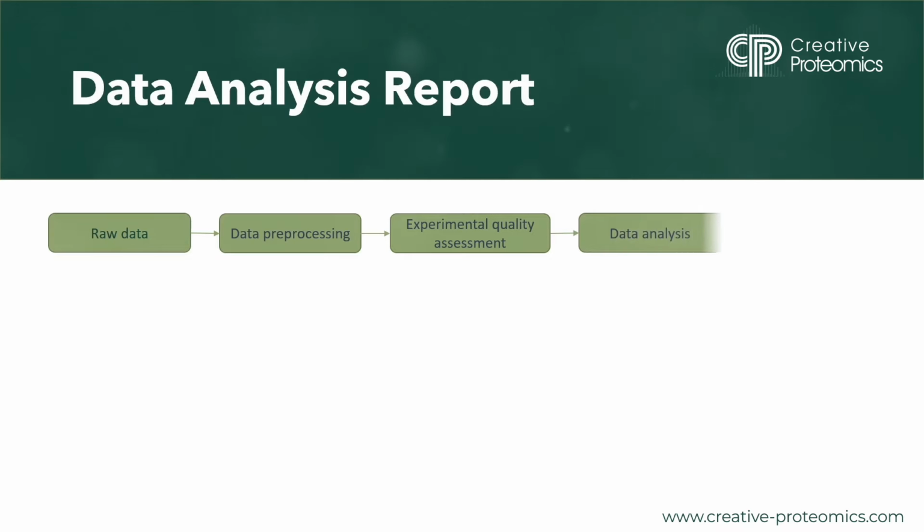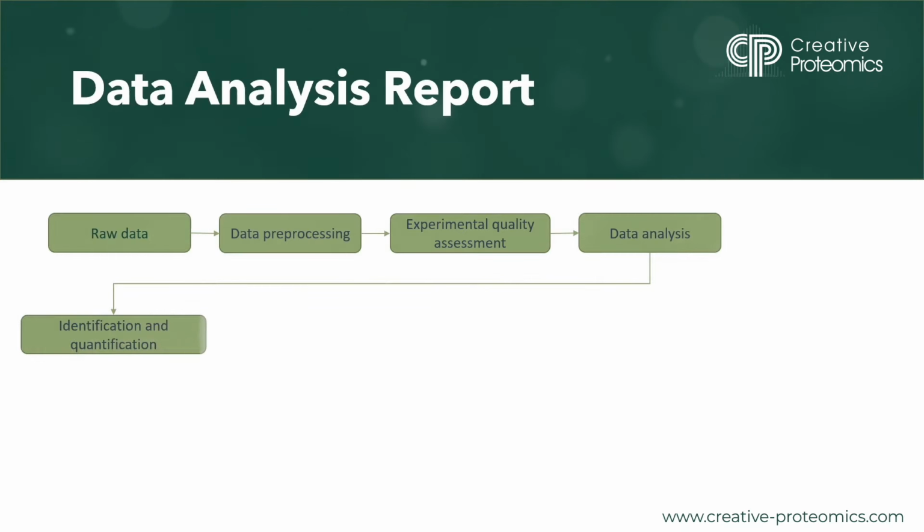Now let's dive into data analysis. Our first task is the identification and quantification of lipid species. We compare our acquired mass spectra with known lipid species in reference databases. This allows us to identify lipids and measure their abundance.